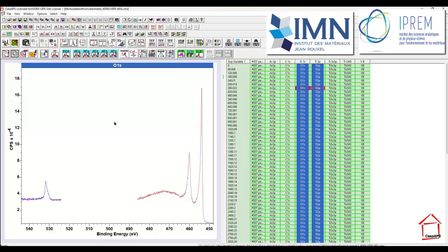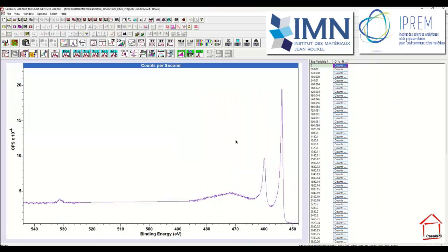So having prepared the scroll list in this way, we're then able to construct a new file using another toolbar button that says merge irregular. So each one of these display tiles with the oxygen and the titanium correlated in this way will form a new VAMAS block in a new file.